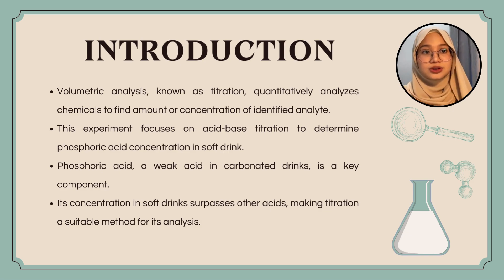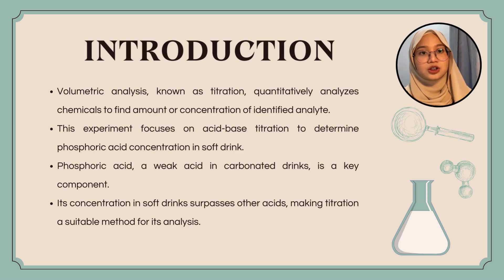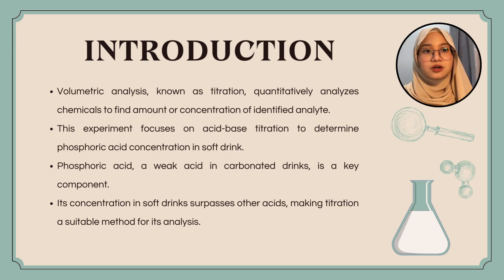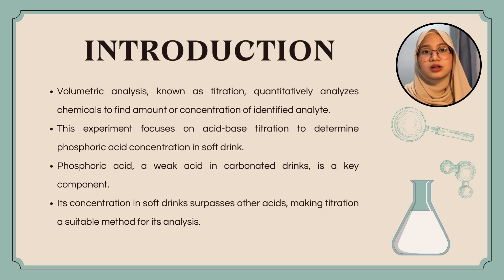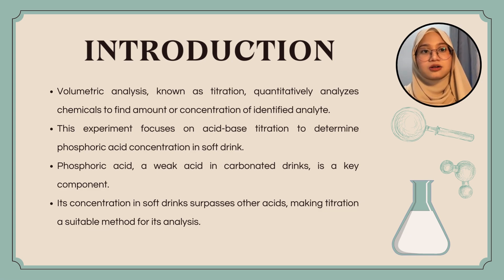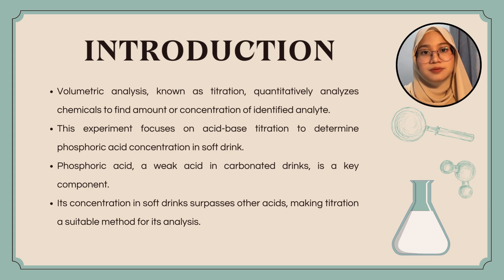We will titrate a sample of soft drink — which we chose Coke — to determine the percentage concentration of phosphoric acid. Phosphoric acid is one of several weak acids commonly found in carbonated beverages. It is a component of all soft drinks and has a much higher concentration than any other acids, so its concentration can be determined by a simple acid-base titration.